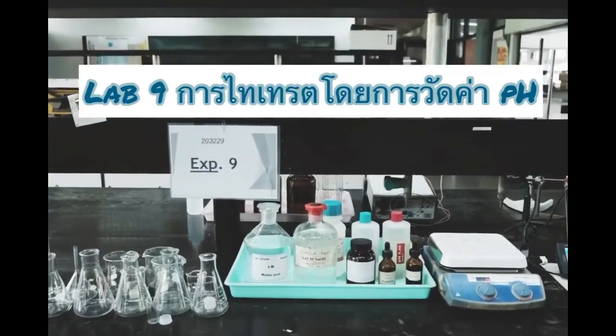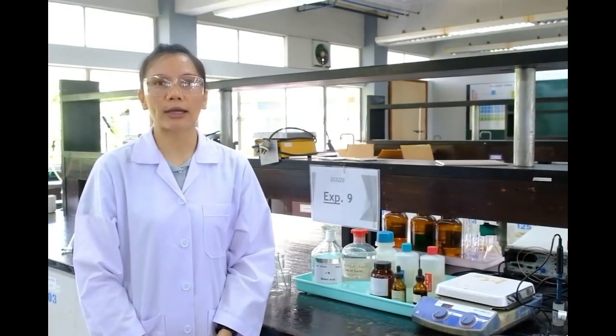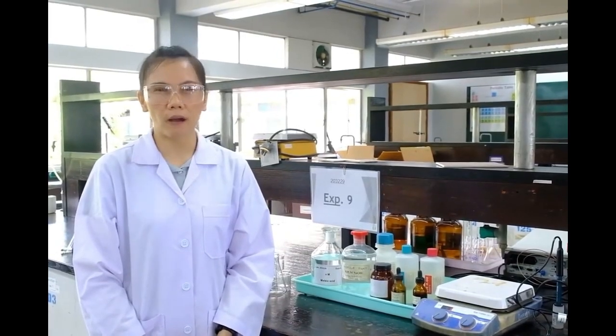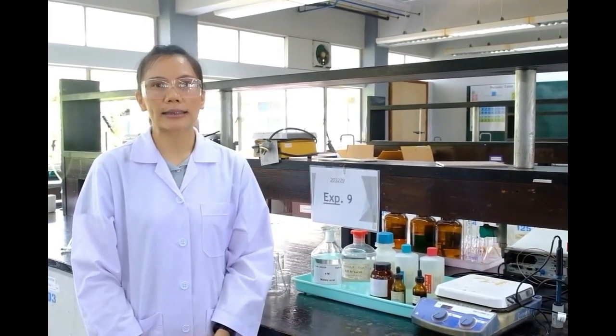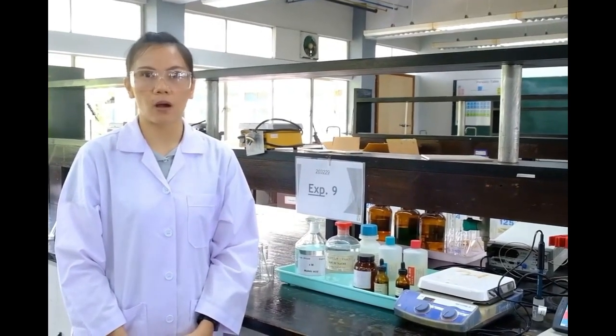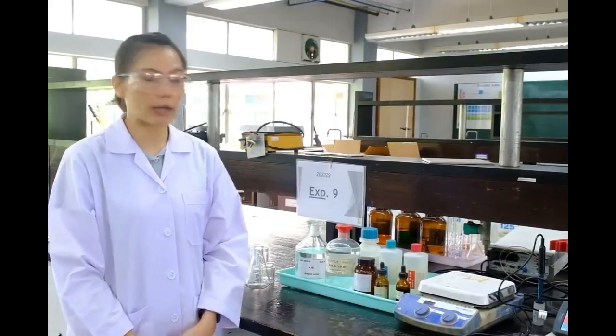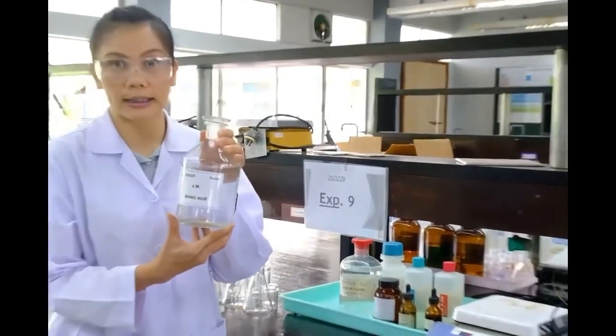This chapter covers titration by measuring pH. The objective of this experiment is to create a titration graph and determine the dissociation constant of a weak acid, or Ka. The weak acid we'll be studying today is maleic acid.